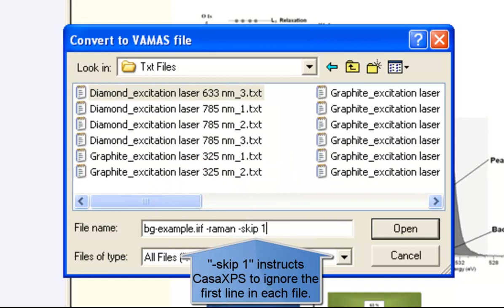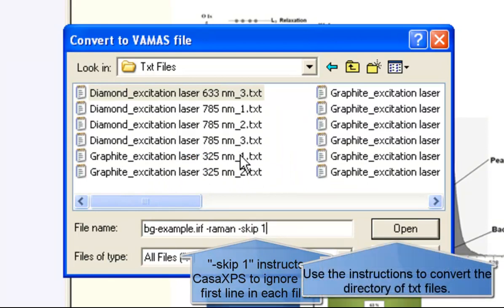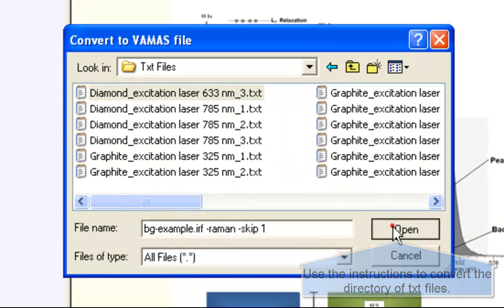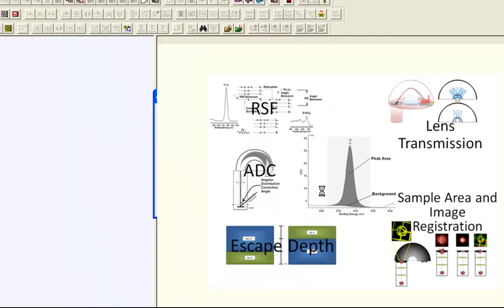When I press open, all of these files will be processed and the data collected into a new VAMAS file.